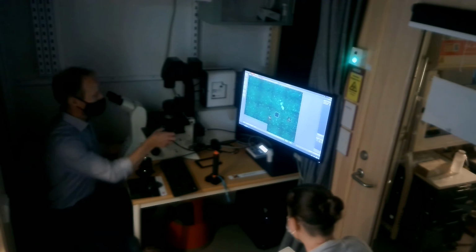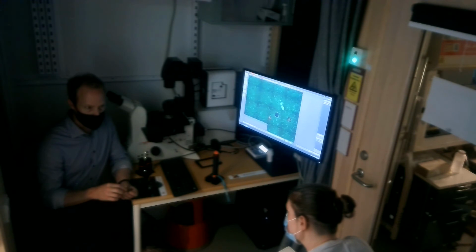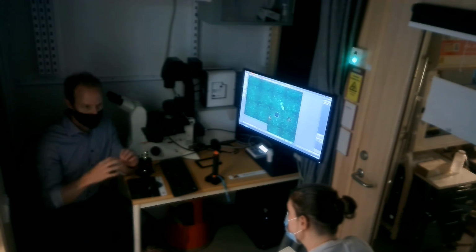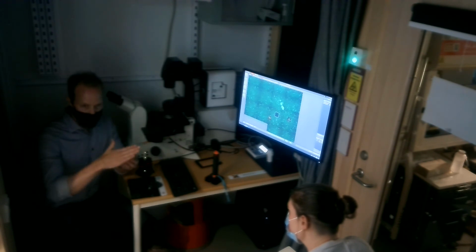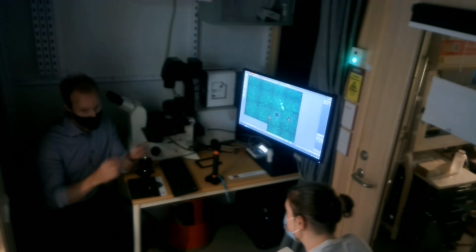If you have something like a cover slip like this that is mounted on a glass slide, very often you grow your cells on the cover slip and then you mount it on the glass slide, but with some mounting medium and so on, and then you're resting it on the glass slide. But sometimes the mounting medium might not be perfectly flat neither, so your cover slip might be slightly tilted. And if that is, then if you move over it, you will have to adjust it.